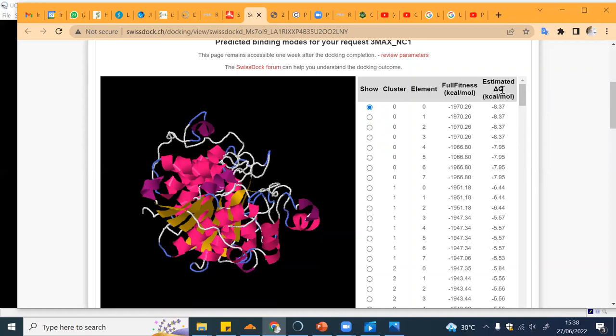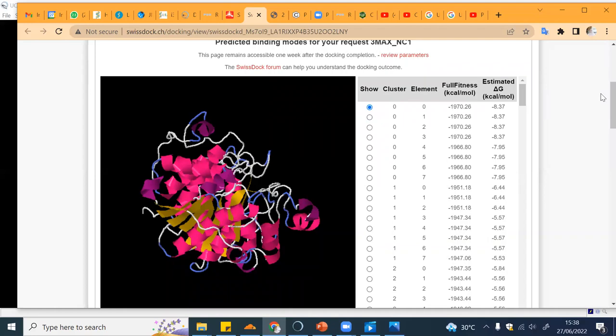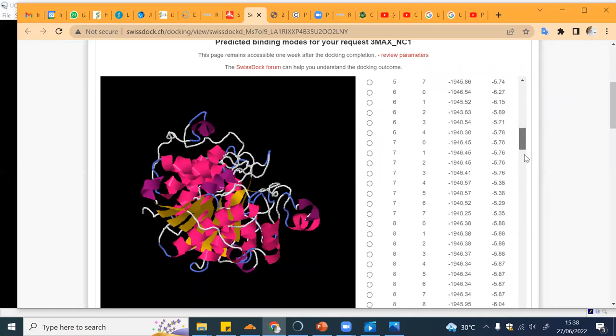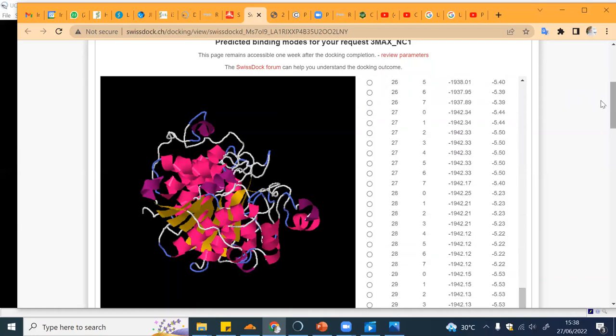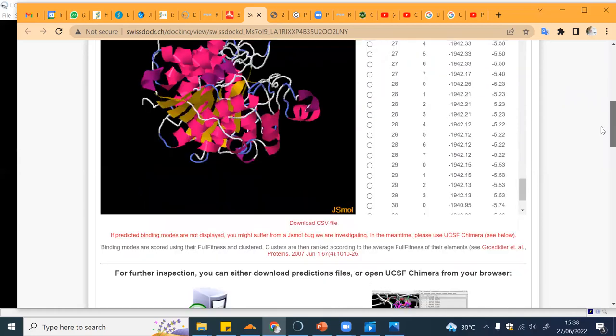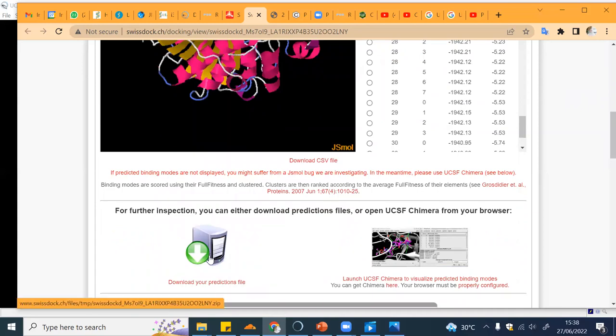You can look at the full fitness, the energy, and the estimated delta Gibbs energy. The more negative it is, the better affinity it has towards the receptor. You can check on that and also download the prediction file, and then we can visualize it in Chimera.